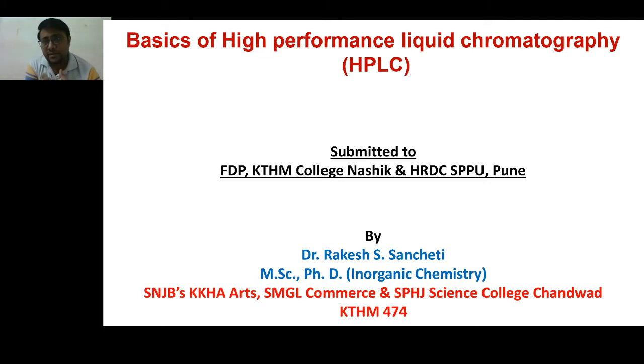Now there are different types of chromatography: adsorption type and partition type, and these types again have different techniques, like thin layer chromatography, column chromatography, HPLC, that is high performance liquid chromatography, and gas chromatography.